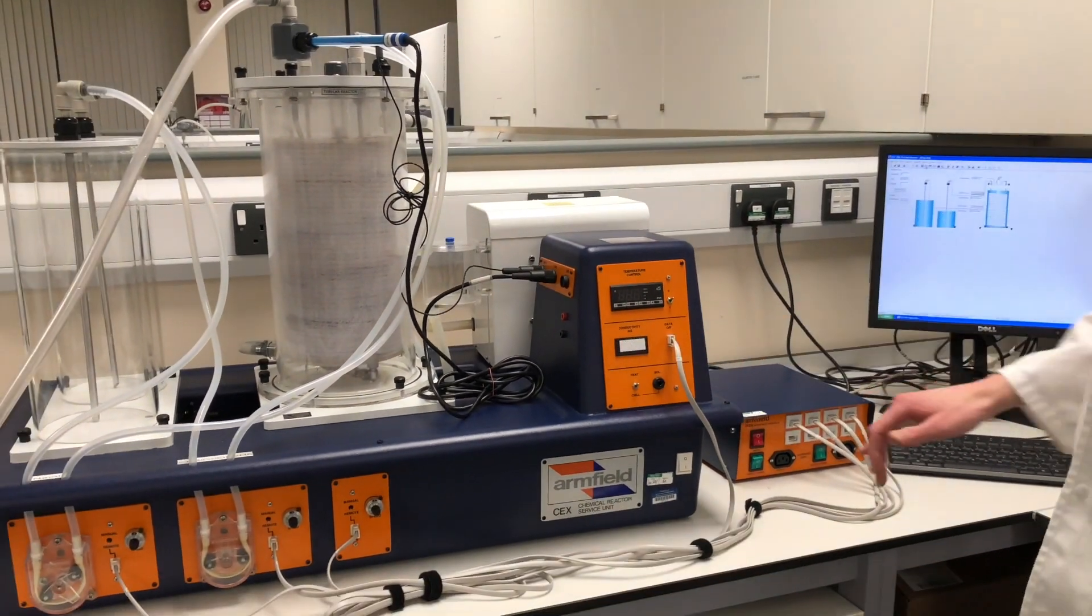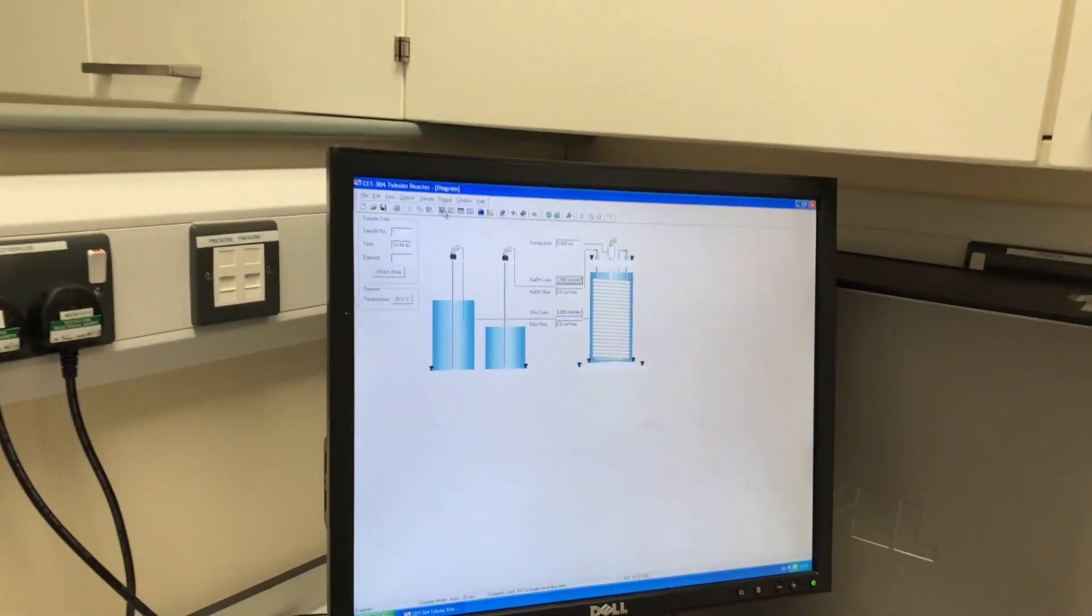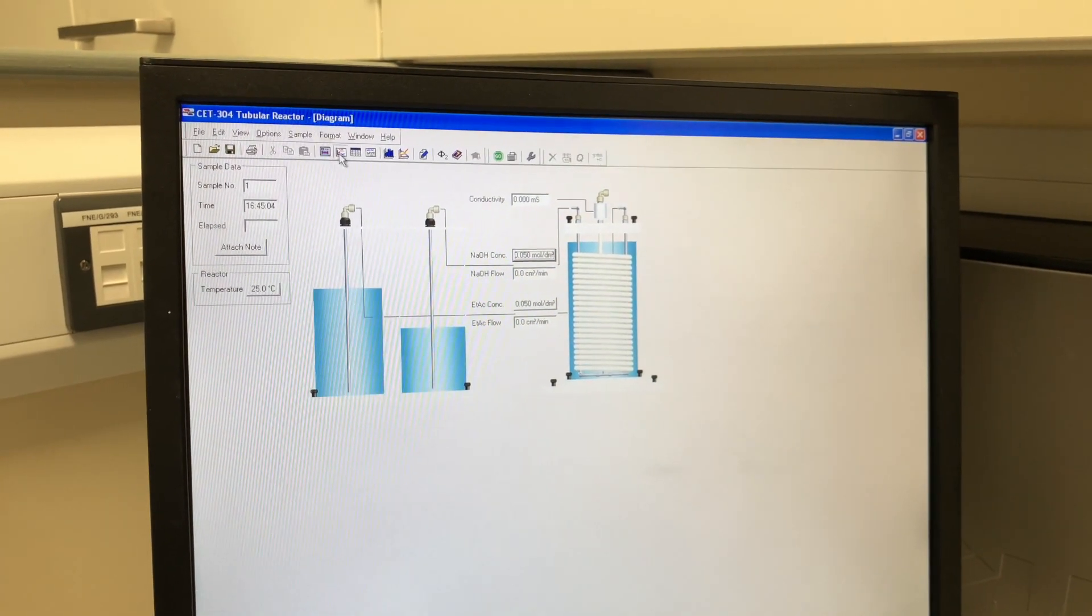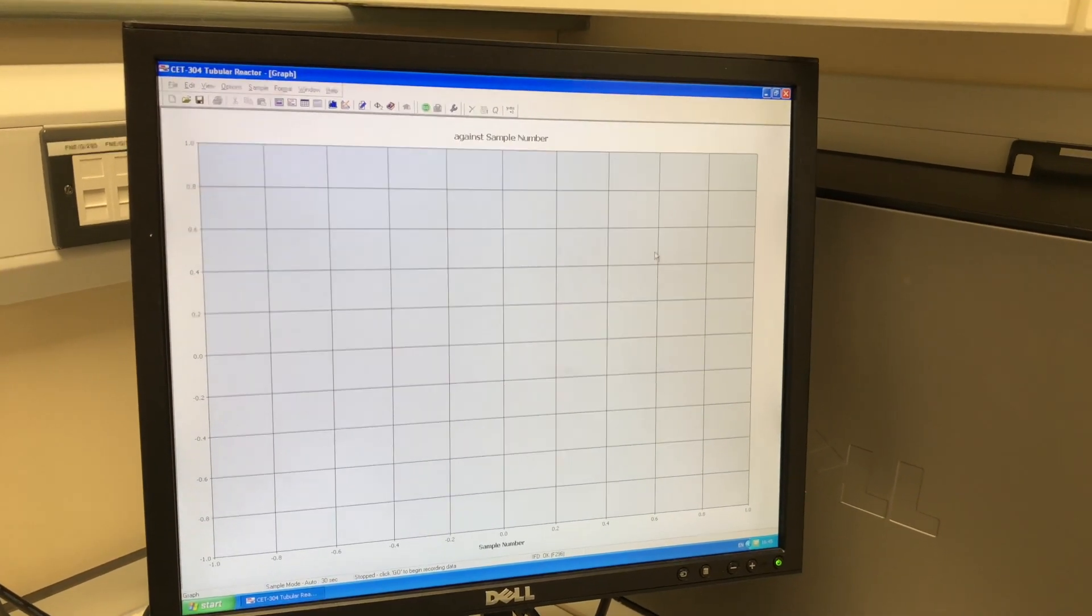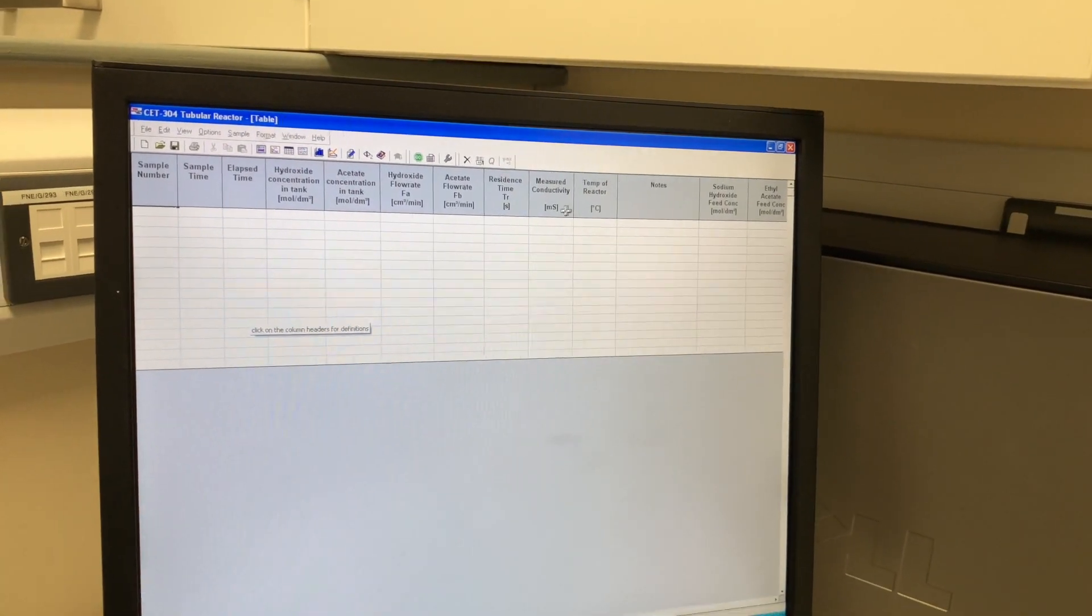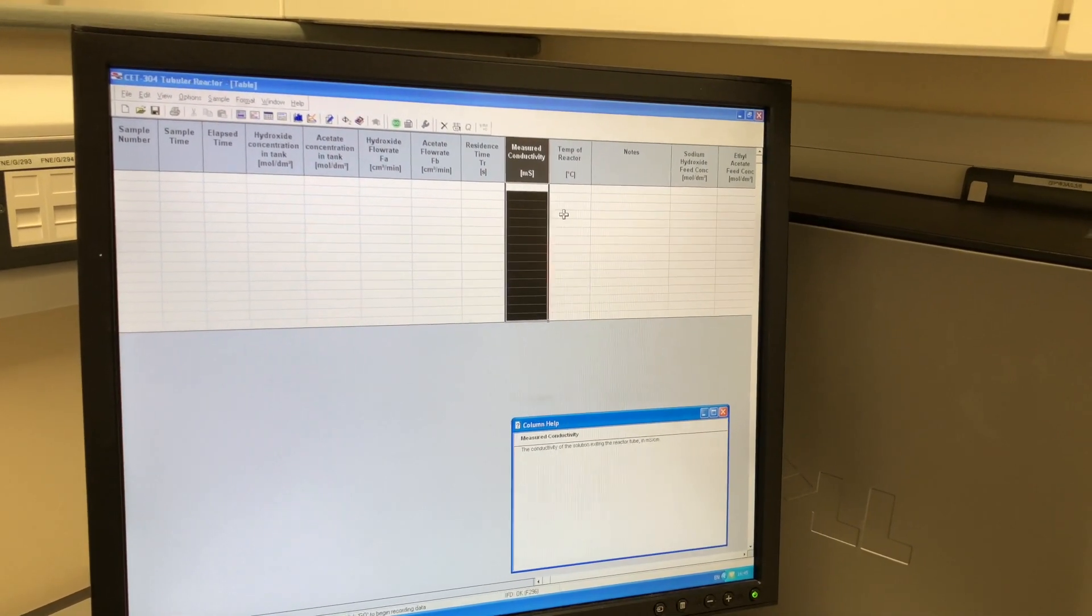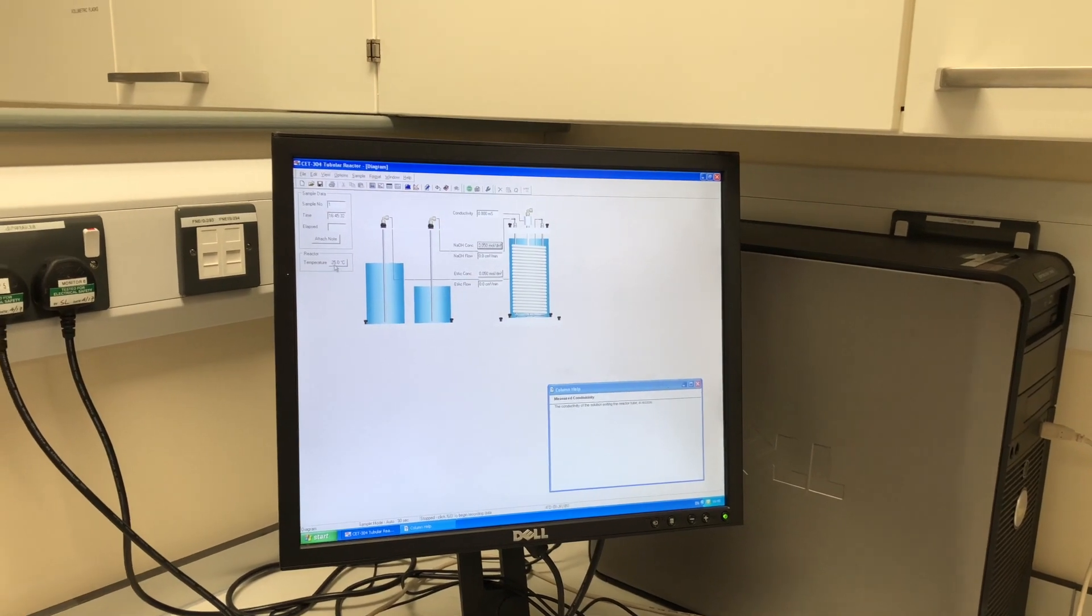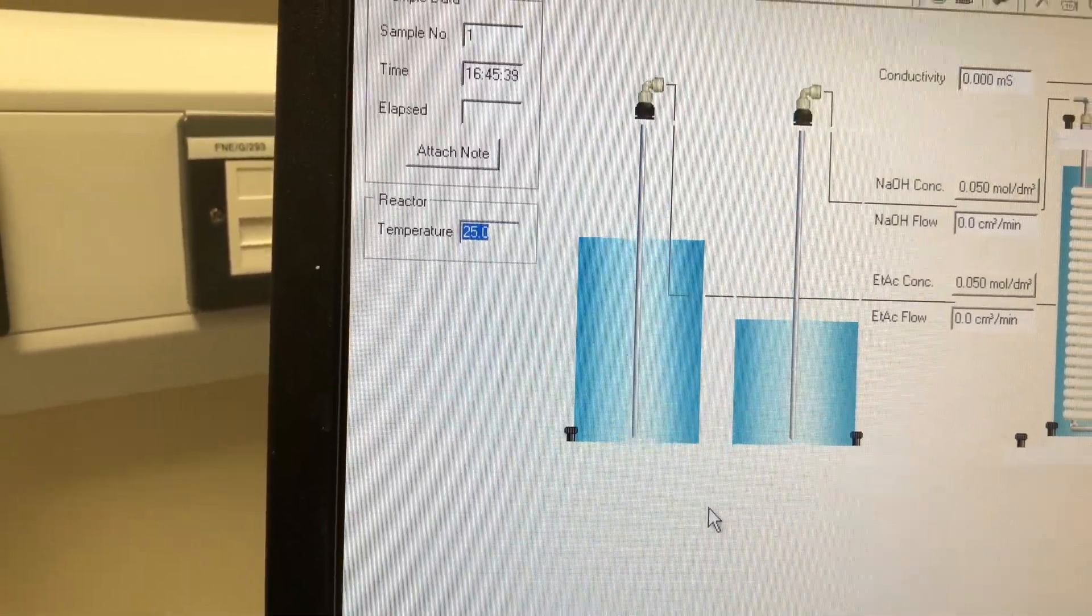The conductivity here we will ignore, as the software is much more accurate with the conductivity probe. So here on the software, we have three buttons that are clear. So one, two, and three. So here is the tubular reactor, and it shows you the setup here. So then we switch across to view the graph. As it records results, it will generate plots, and then this will display on the graph here. The things that are most important for you is the actual table, and this is the table of results. So the two key columns here is the temperature of reactor, the measured conductivity, and obviously as the reaction goes on and as the temperature varies, you will need to continuously adjust the temperature, which is done so here.